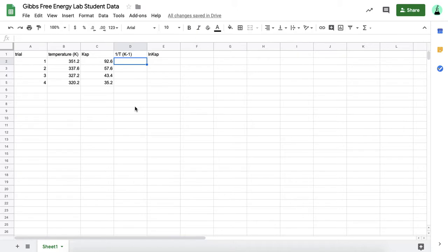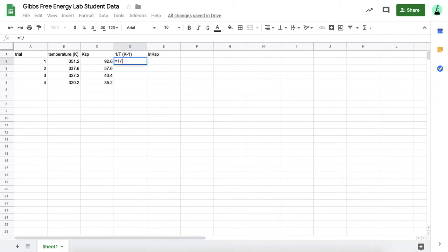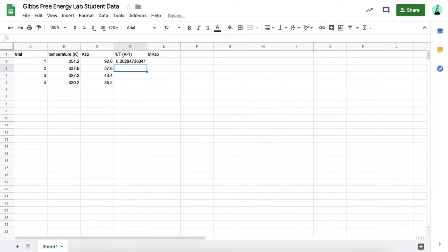If you're not familiar with this, all you have to do is hit equals, and then you're going to type in some formula. For this, we want the inverse of the temperature. So I'm going to say whatever is in this cell is going to be equal to one divided by this temperature for trial one, and then I'm going to hit enter.